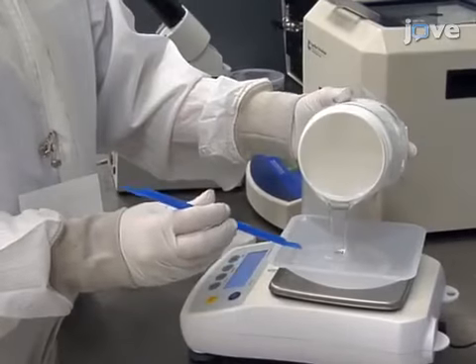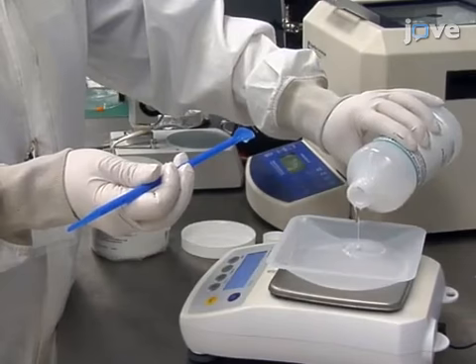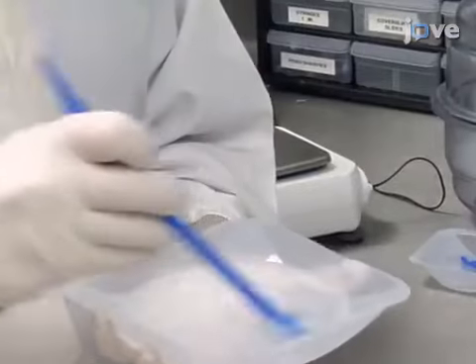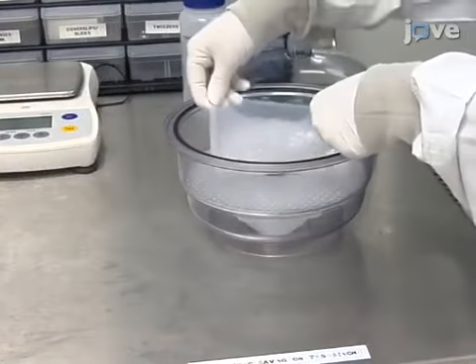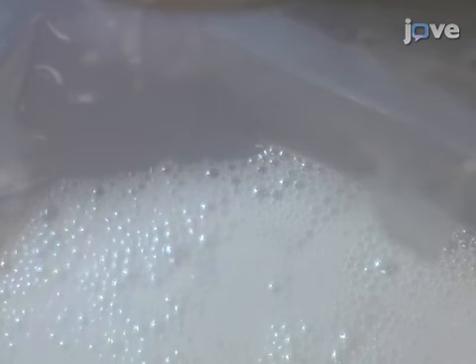In another dish, weigh a 5:1 PDMS mixture for an amount enough to fill a control valve master mold up to 1 centimeter thick. Mix both parts evenly with a spatula, and place the dishes inside a vacuum desiccator for 20 to 30 minutes to degas all bubbles from the mixture.